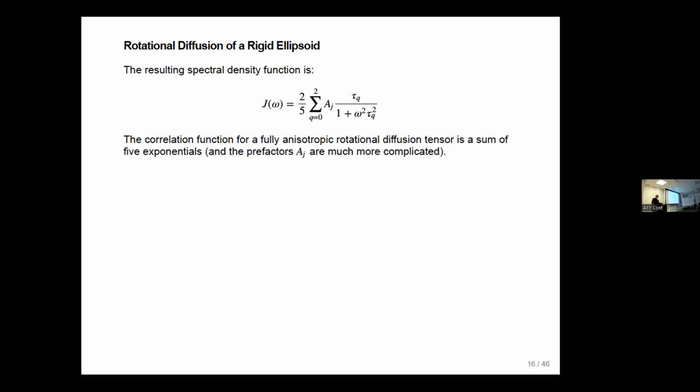So if you cut the field in half and say you go to 400 megahertz, the CSA is still 25% of the dipole interaction. And for a large protein, 500 is already getting difficult from sensitivity and resolution. So, yeah, no. In fact, it's better for us that it's larger because the TROSY effect is so important.